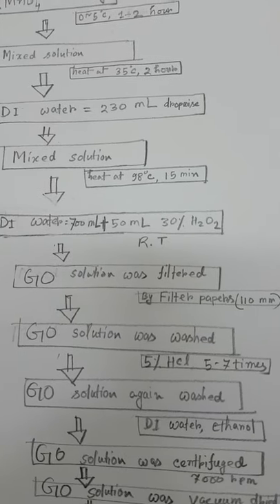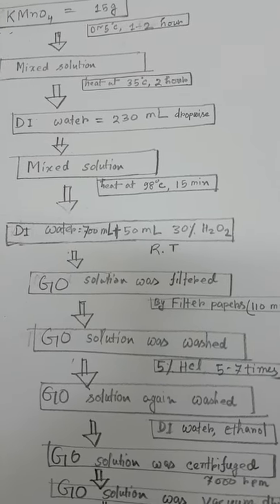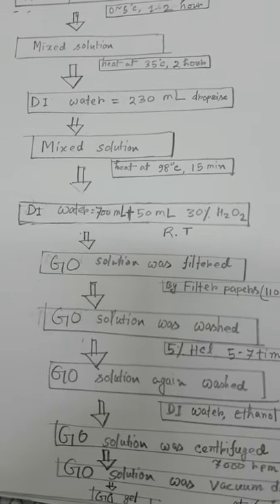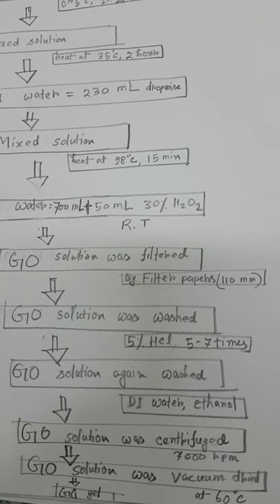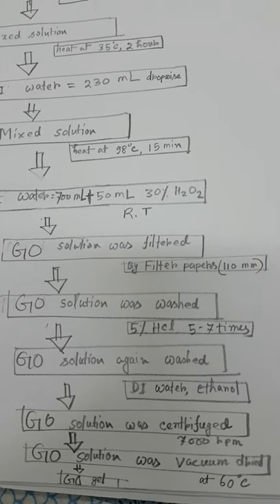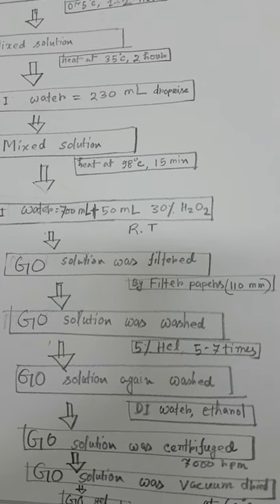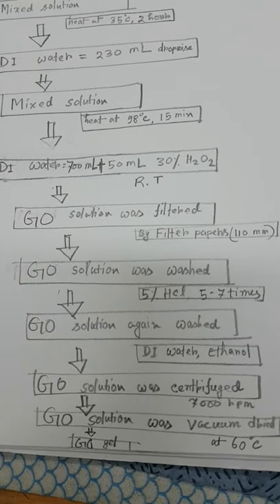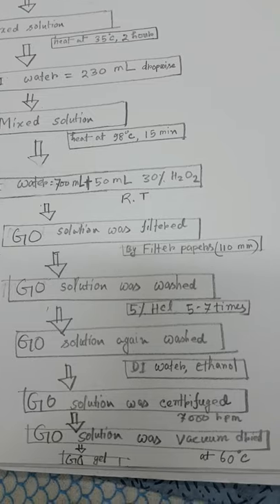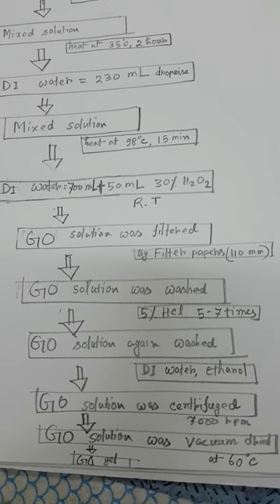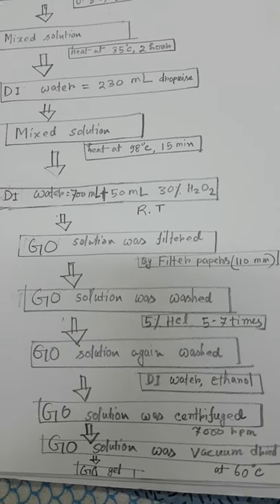Then I washed the graphene oxide solution with 5% HCl so that the remaining ions should be neutralized. Then again I washed with DI water and ethanol. Then the graphene oxide solution is ready.